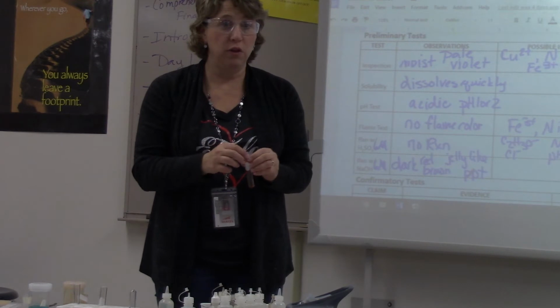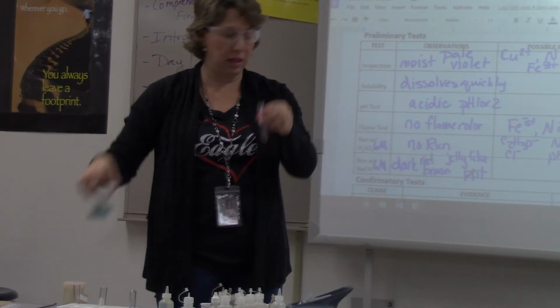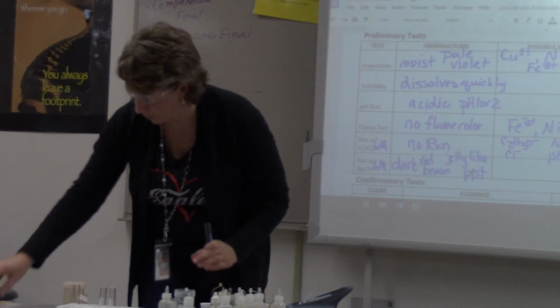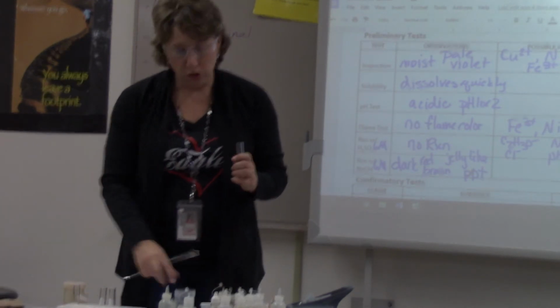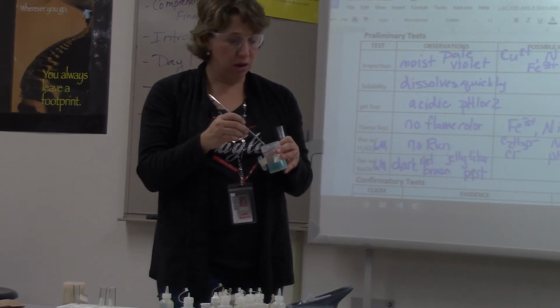You could if you wanted to know for sure. But if we're looking color-wise, I'm going to assume that's probably not necessary. But to be scientific about it, we should probably try it and see what happens. Now, in your lab notebook, do you want to write down that it forms a colored compound? Do you want to write down what that colored compound is for iron?